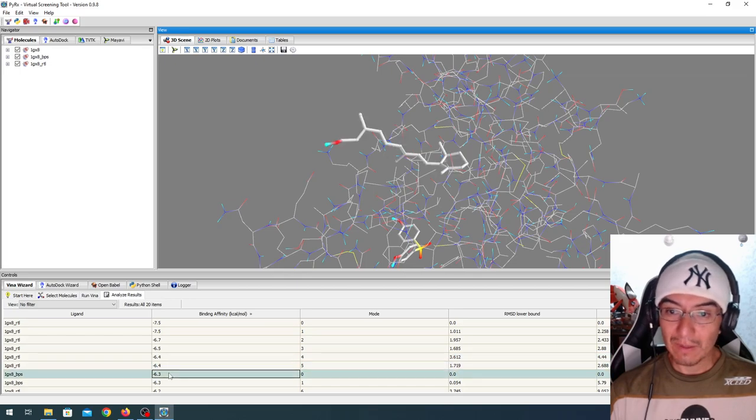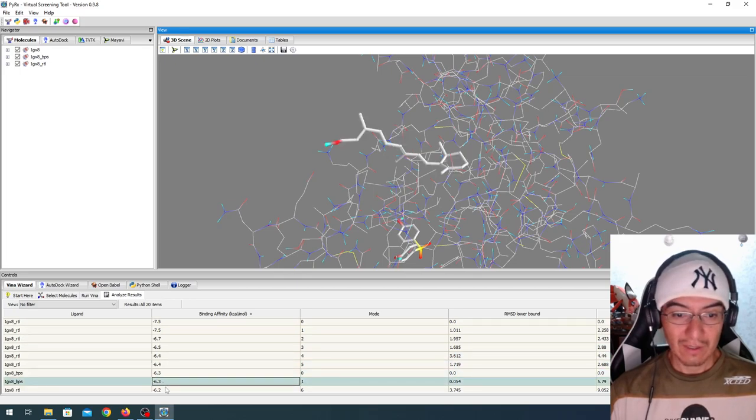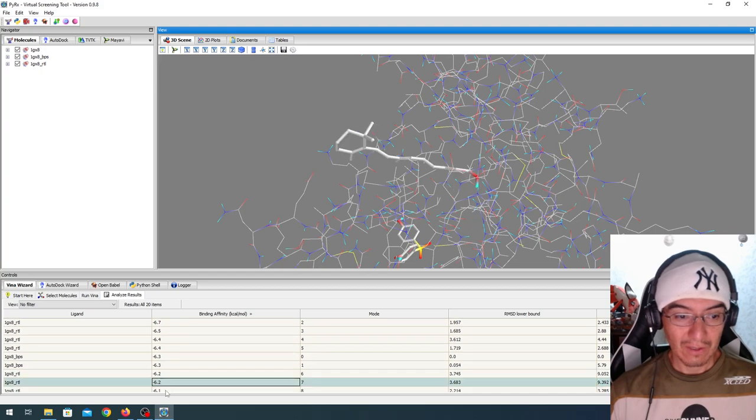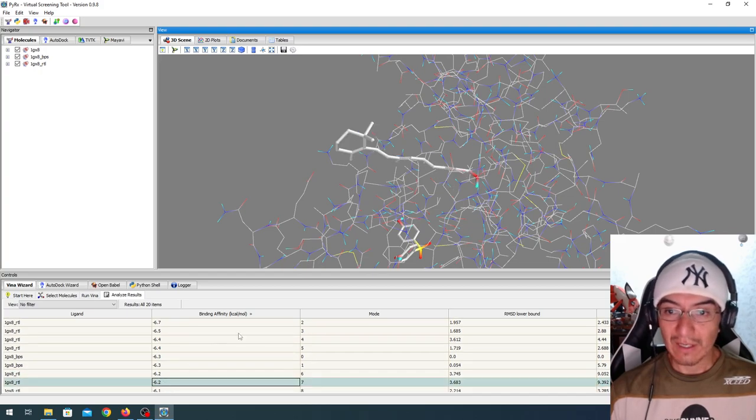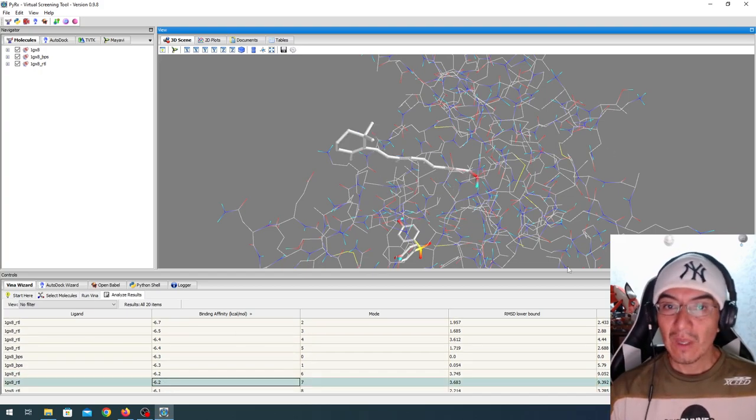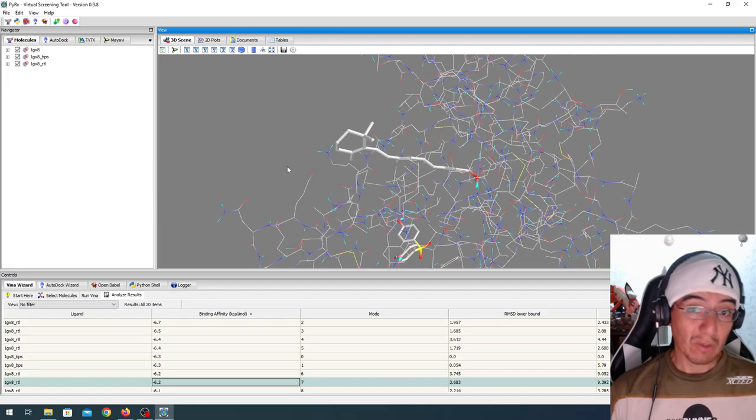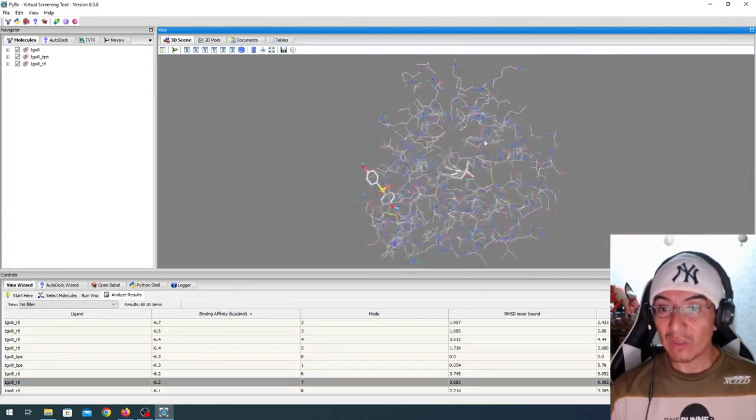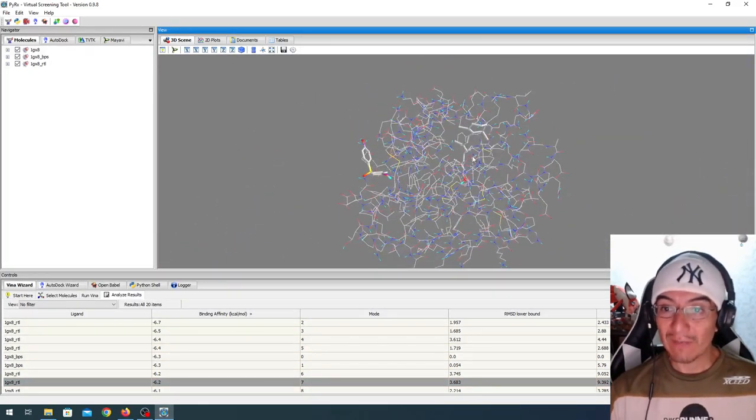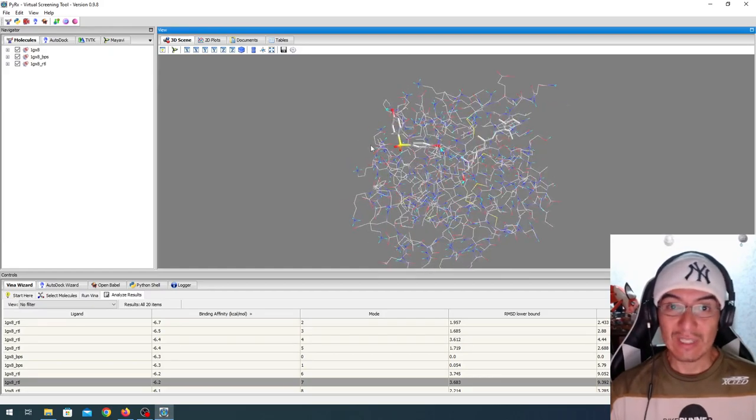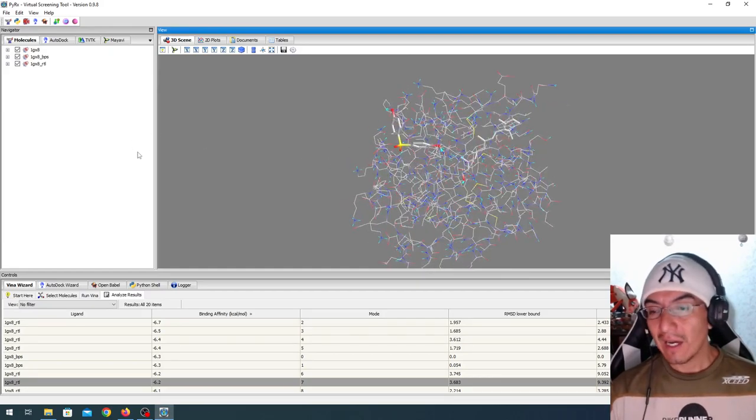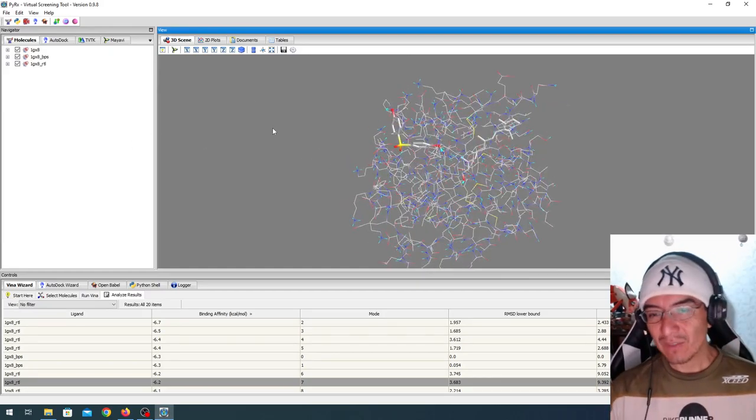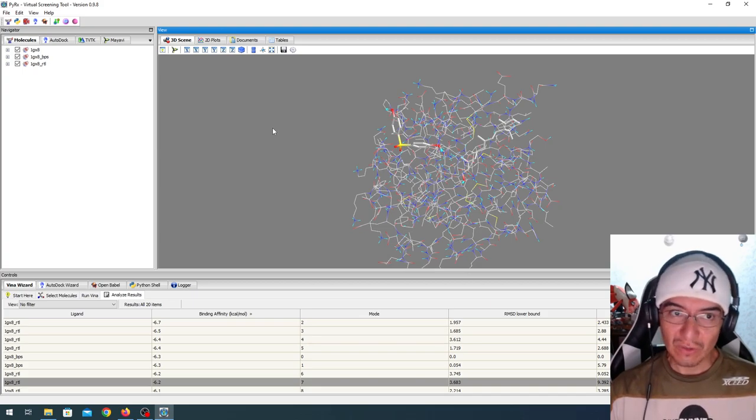And then BPS and RTL and retinol. That was pretty quick, pretty easy. We ran two dockings. One found the binding site, whereas the other didn't. But the analysis within PyRx is not as good.